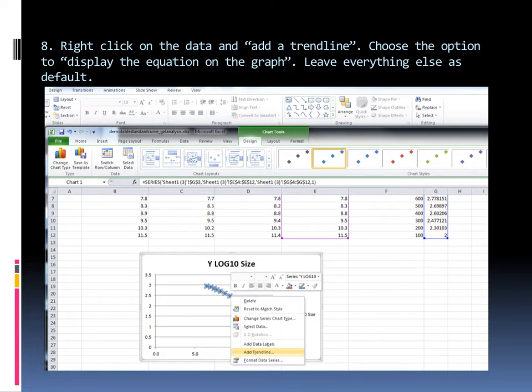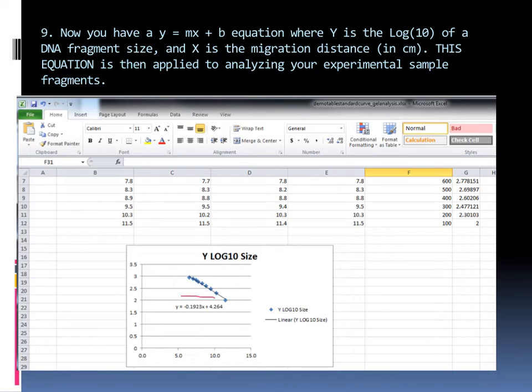Okay, once you have a scatter plot, what you will do is click on the data and choose add trendline, and choose the option to display the equation on the graph, leave everything else as default. And that will get you an equation associated with this data. You can see that it's a straight line. So this equation is the form Y equals MX plus B, something you should be familiar with. So here we have our equation where Y equals negative 0.1923X plus 4.264. Remember that X is migration distance in centimeters, and Y is log to the base 10 of a DNA fragment. So now we have an equation that relates the log to the base 10 of a DNA fragment size to migration distance in a gel. This equation will then be applied to analyzing your experimental sample fragments.